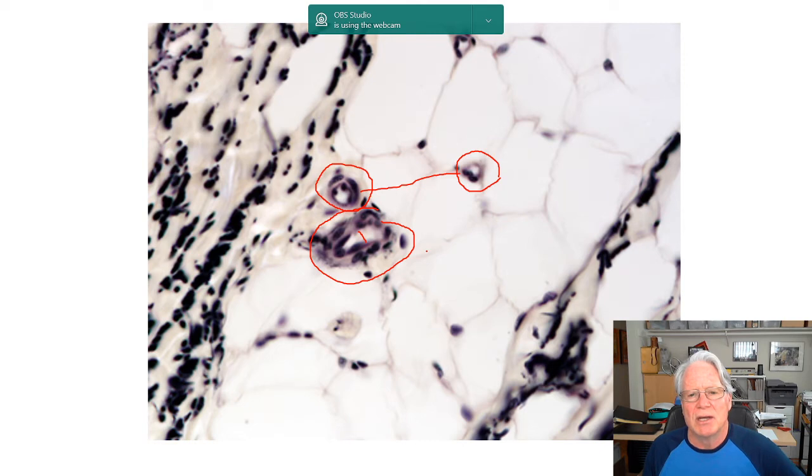Okay, so this is just something I'm pointing out. I'm not going to ask you to identify this in any of the tests, but it's an opportunity for you to see this when you go further in 40B and you start talking about these capillaries. At least you'll have some idea of what they might look like.